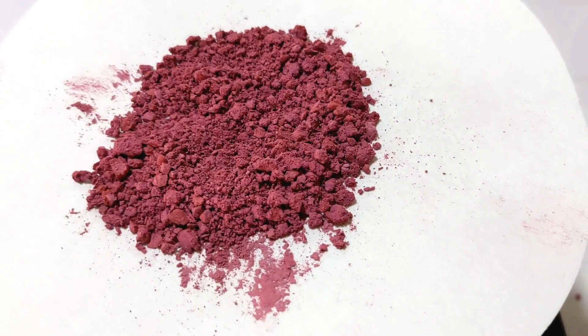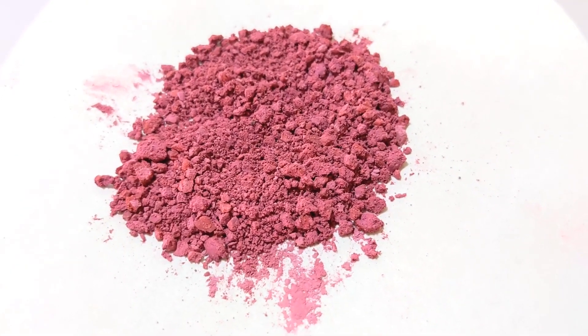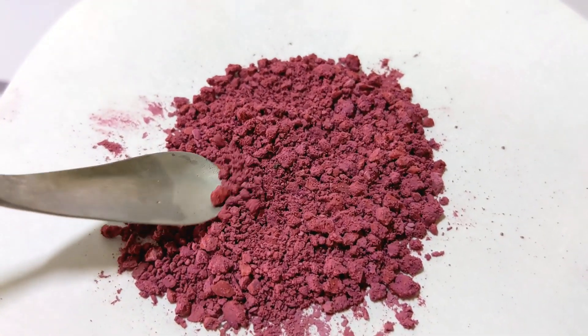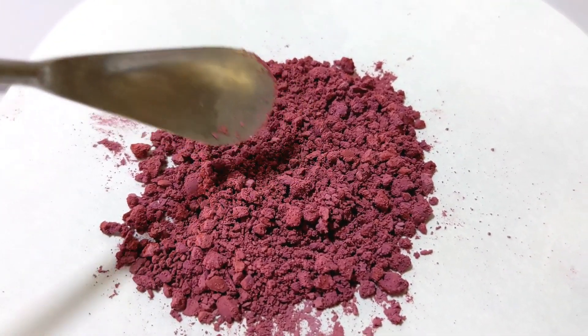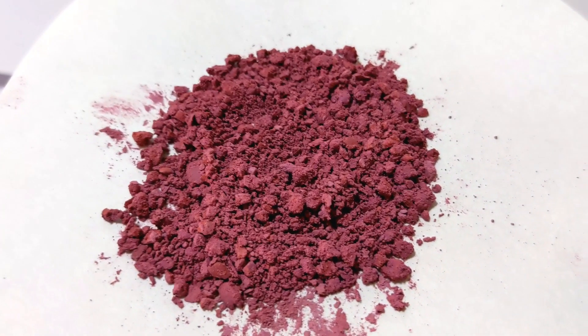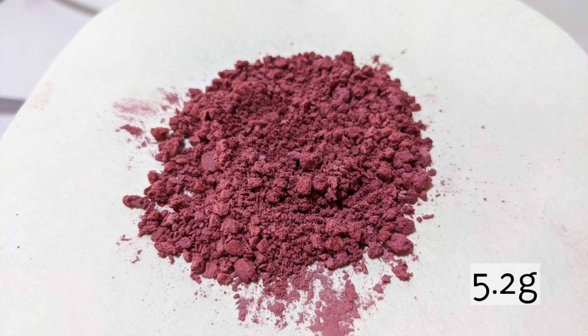Here is the dried product — this is the final product chloropentaamine cobalt-3 chloride. We got 5.2 grams of the product, which represents a yield of 53%.